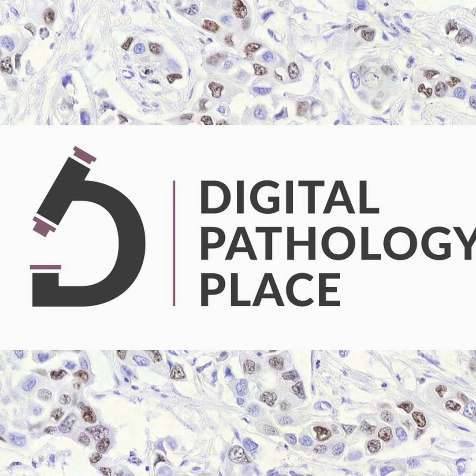This is definitely something like a hidden gem. A hidden gem and a hidden pearl, and an incentive to actually do it the way you guys are doing it. Yeah, for sure. And if you're looking for specific cases, specific tissues, specific patients that match some very precise, intricate profile, that's instantaneous when all the data's been structured like that up front. Yeah, and there are a lot of obvious ways that people can use that to build value for their institution, for themselves, for the patient. It enables a lot.